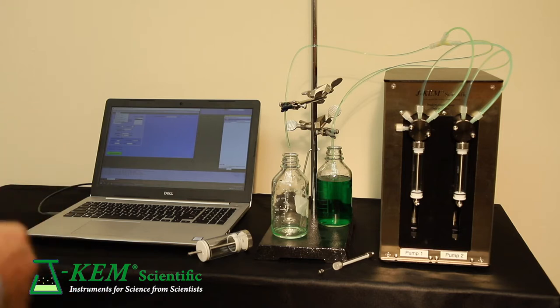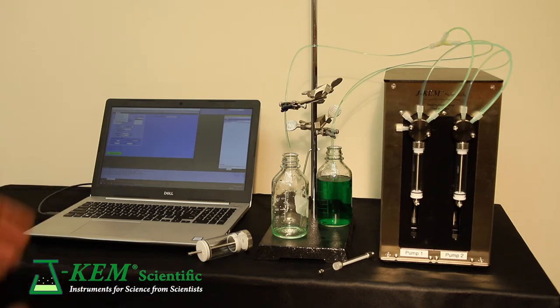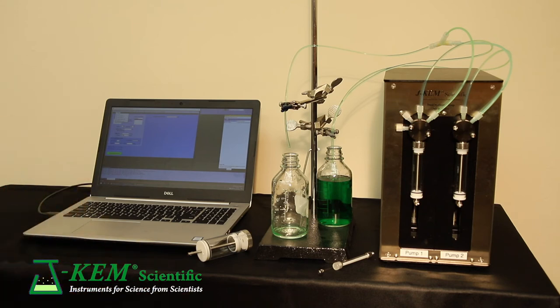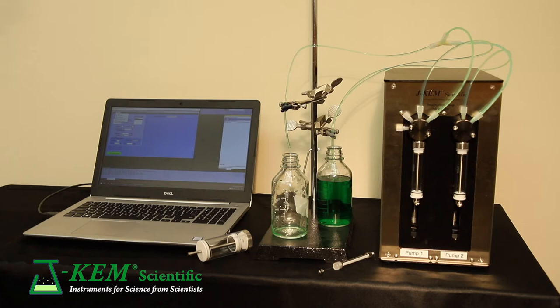And then you could say, go to port B, which would be your second solvent, withdraw five milliliters and add it to my reactor. And then port C and D and so on. So any of the ports can be used for addition or withdrawals completely under program control.